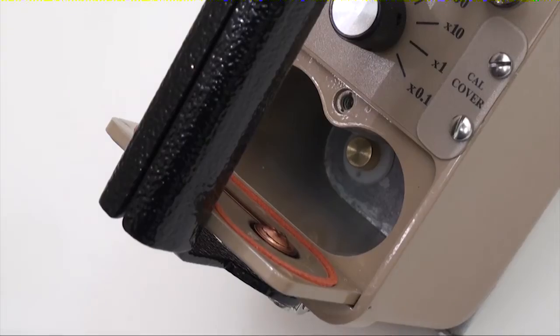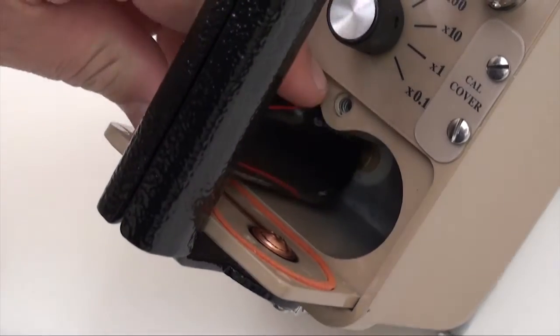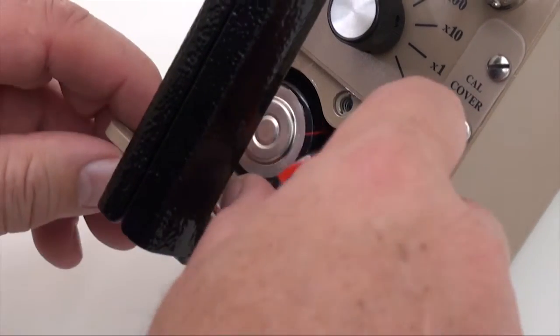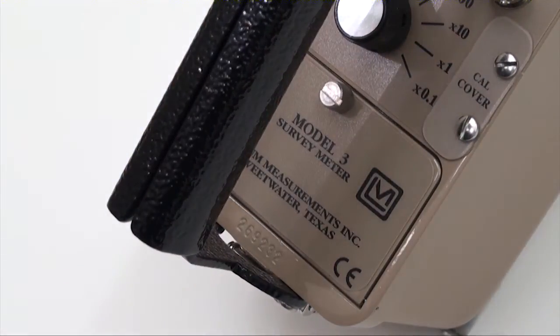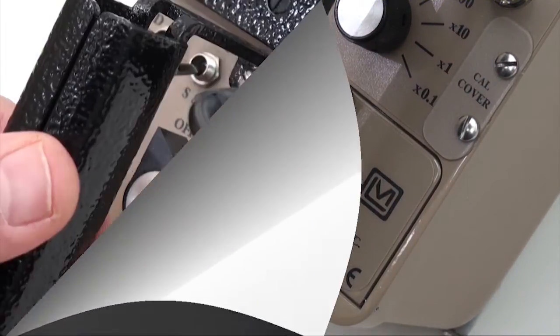The batteries are housed in a separately sealed compartment which isolates them from the instrument electronics in the event the batteries leak. Access to the batteries is via a front panel door equipped with a quarter twist latch to facilitate easy replacement.